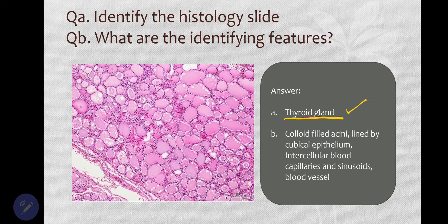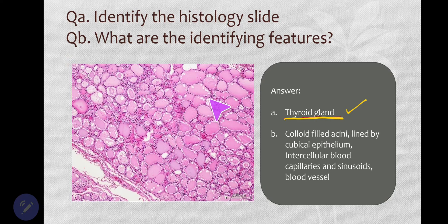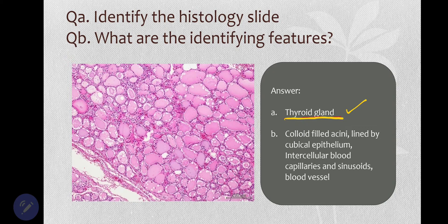First of all, look — there are so many acini, and these acini are filled with a pink colloidal matrix. This colloidal matrix takes on a good eosinophilic stain, so they all appear pinkish.